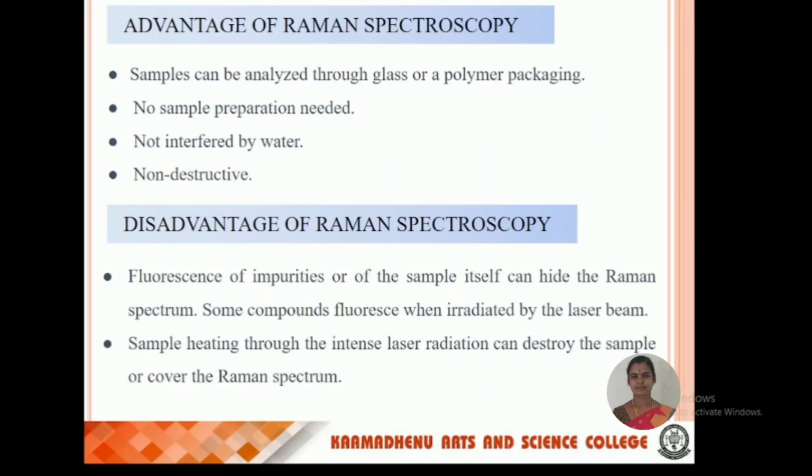Then advantages of Raman spectroscopy. Sample can be analyzed through glass or polymer packaging. Then no sample preparation needed. Then no interference by water. Last one is non-destructive. Finally, we have disadvantages of Raman spectroscopy.